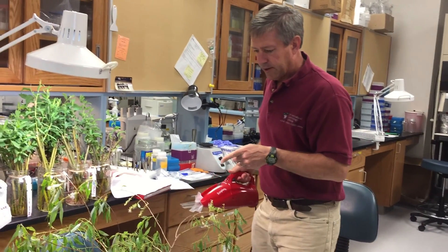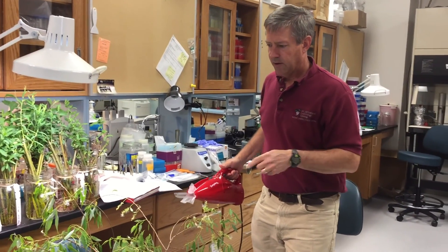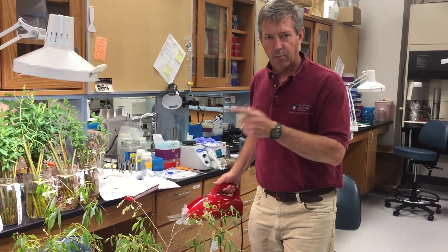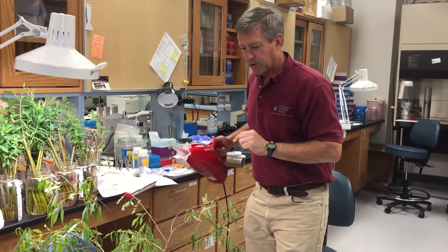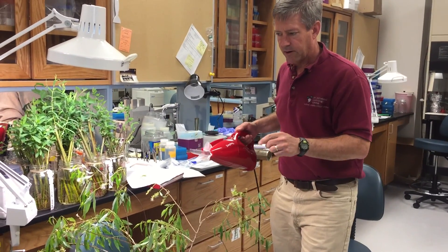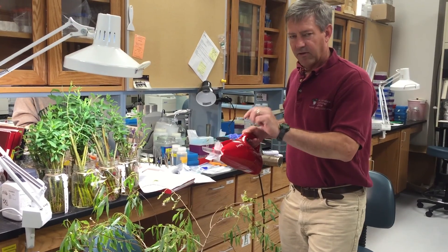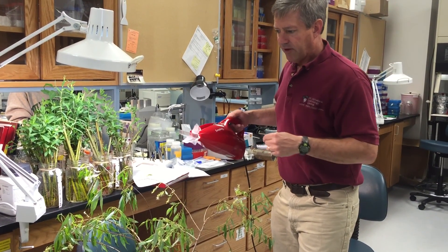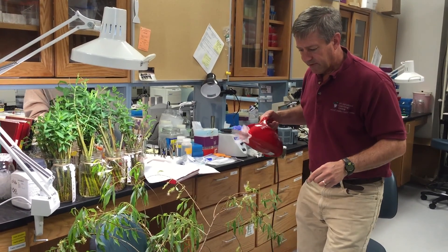We brought the shoot in from outside. We're keeping it in the lab because it was covered with insect pests, so probably not a great thing to bring into the greenhouse. And you can see that just in a bucket of water, these catkins that were pollinated outdoors are now releasing seed that we're going to vacuum up.